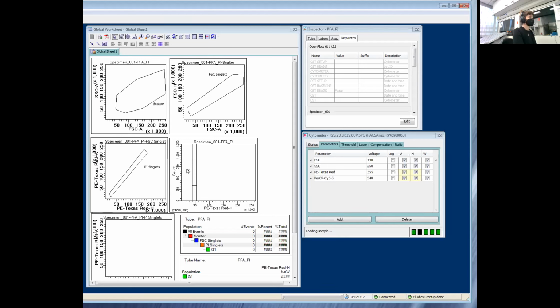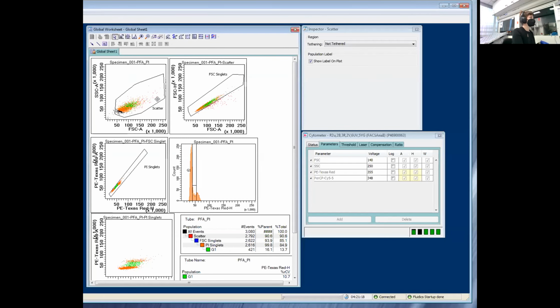And it's important to note that Kwanchung did prep these samples for us yesterday. So we have run this before, and this is about the second time that we're running this. But it goes to show that you can do the sample prep, and while it's great to look at it right away, we're still able to look at this the next day, which is a nice note. Okay, so I'm going to go ahead and record this sample.